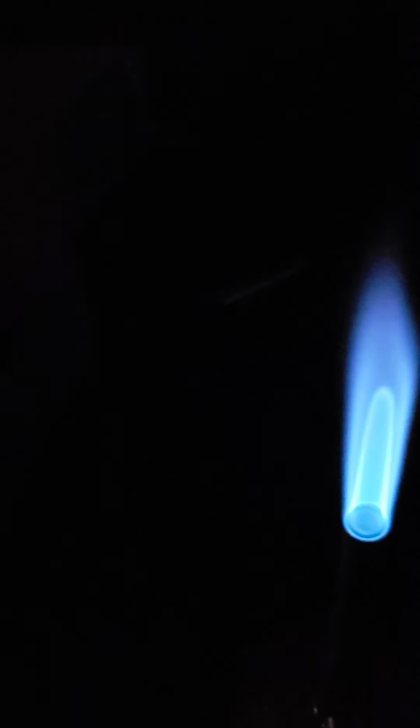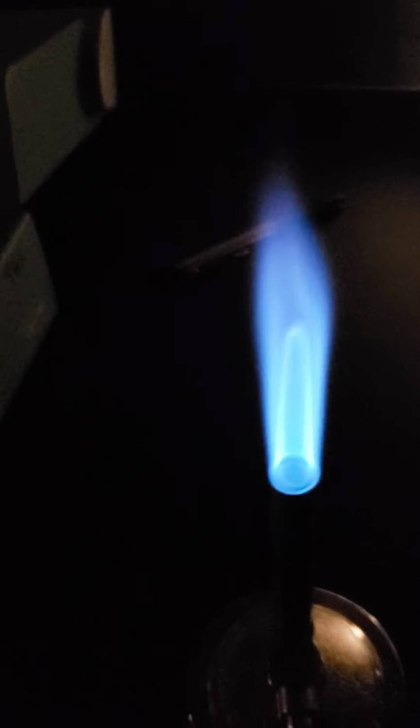And so we got a Bunsen burner going, we got three sticks that we're going to be using. We've got three different chemicals you can see here. The first one is sodium, then we have strontium, then we have copper, and these are all salts, like copper chloride, sodium chloride, or something like that. I can look more specifically here in just a minute. Basically, we're going to take one of these sticks here.